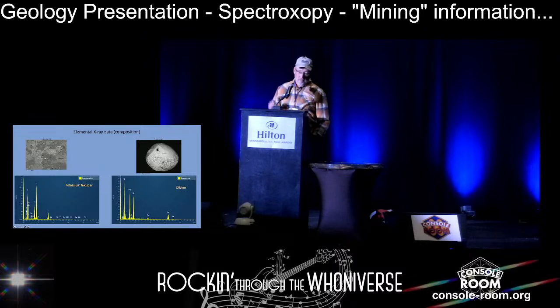So probably the most useful feature, though, on the SEM is the fact that we can get chemistry data from a very small location. The thing on the left is that thin section of granite where we picked one of the spots. We see the spectrum again, and we can see the elements that are present and the intensities, which are related to the concentration. That pattern doesn't tell us what mineral it is. We have to figure that out.